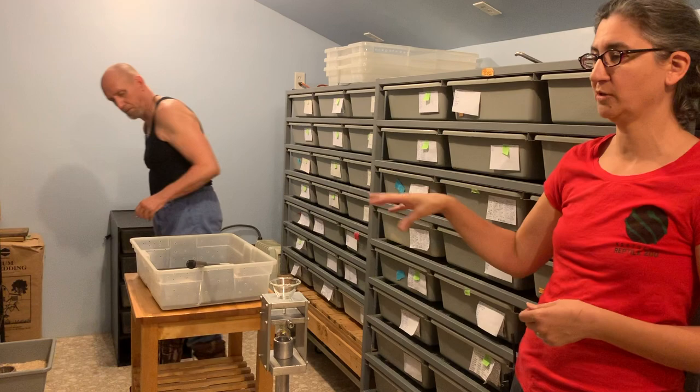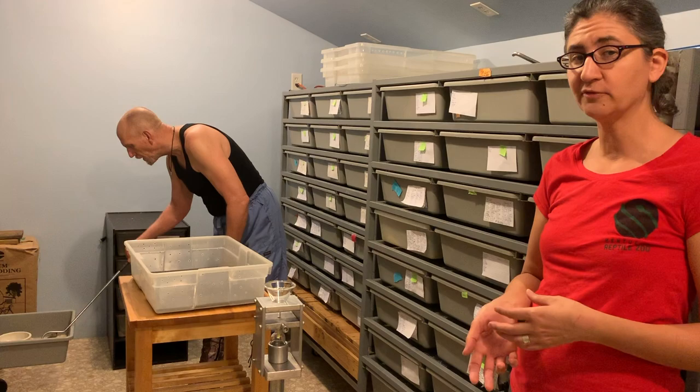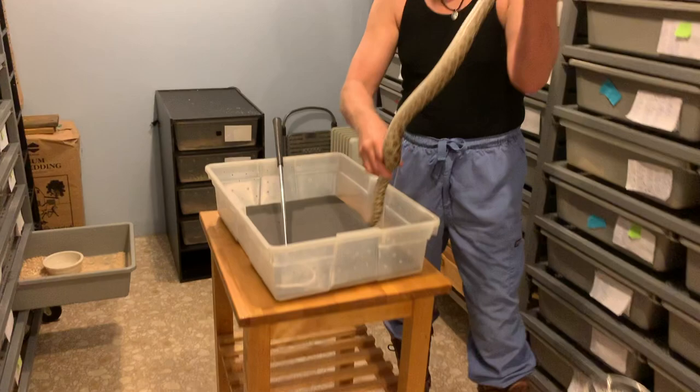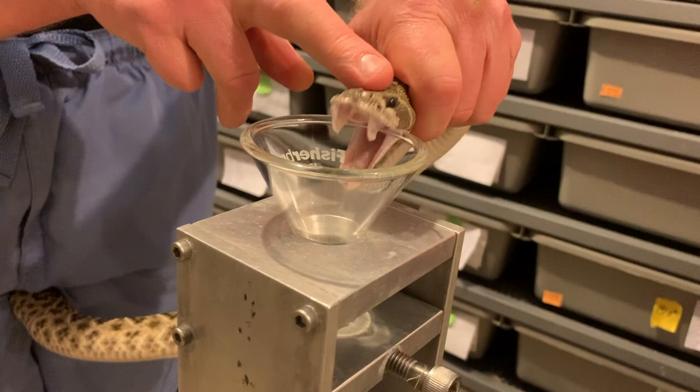Basically the snake views the extraction procedure — the whole thing — as a predator encounter. So it is not physically harmful for the snake, but it is scary for them. They think Jim wants to eat them, and they are just trying to protect themselves by biting, which is a defense mechanism of most snakes.